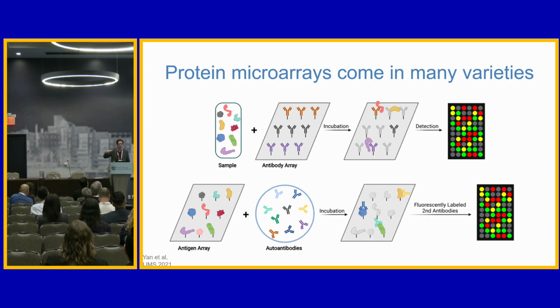We would wash people's antibodies over those and see whether they had reactivity, and in what areas of the protein they had reactivity. That's what led to the vaccine creation. So these are really powerful techniques for making measurements of the proteome, or at least parts of it, in this case the autoantibodies generated in an individual. Protein microarrays are a powerful technique for doing specific tasks like that.